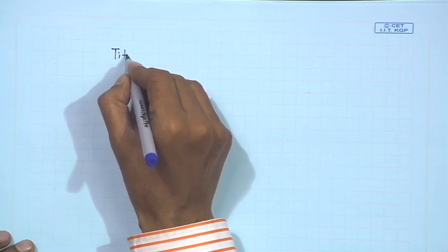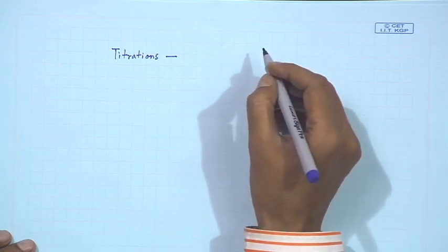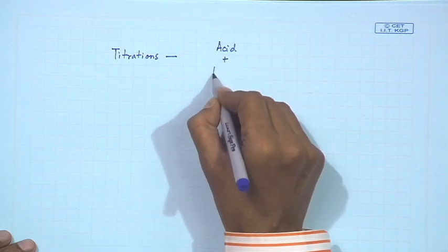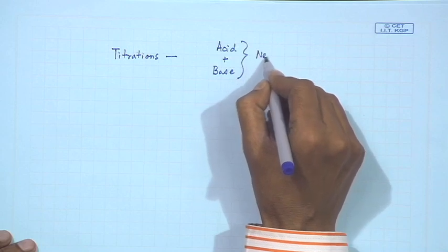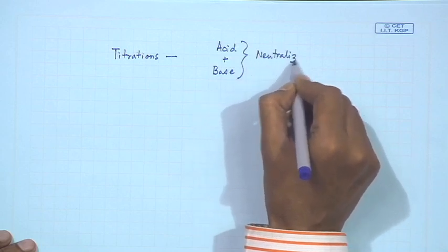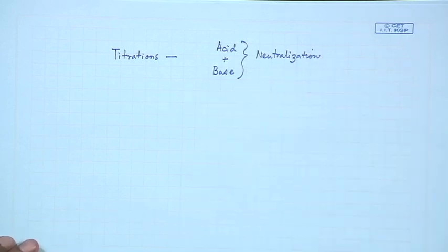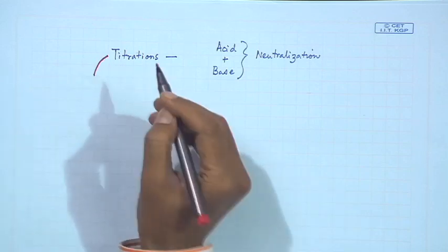Hello, welcome back to this class of thermal analysis, where we are talking about the corresponding titrations, because we all know the simple titrations where some acid is utilized with that of our base and we go for the corresponding neutralization reaction. And how we can monitor this particular titration thermally. So, we will just simply put something which is the thermal term.